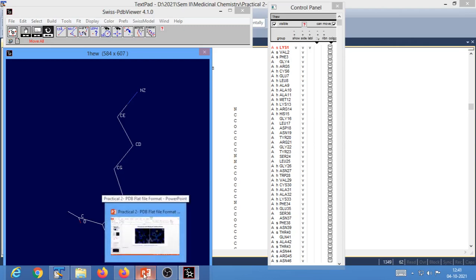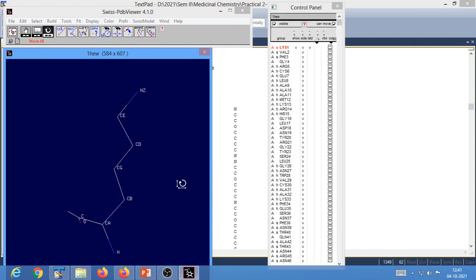Since the electron cloud is not detected from hydrogen, the spot of the hydrogen atom won't appear on your detector. If the spot is not detected, there would be no intensity for hydrogen atom. If there is no spot and no intensity, you cannot obtain the electron density map of hydrogen atoms. No electron density map means hydrogen atoms cannot be resolved in this case.